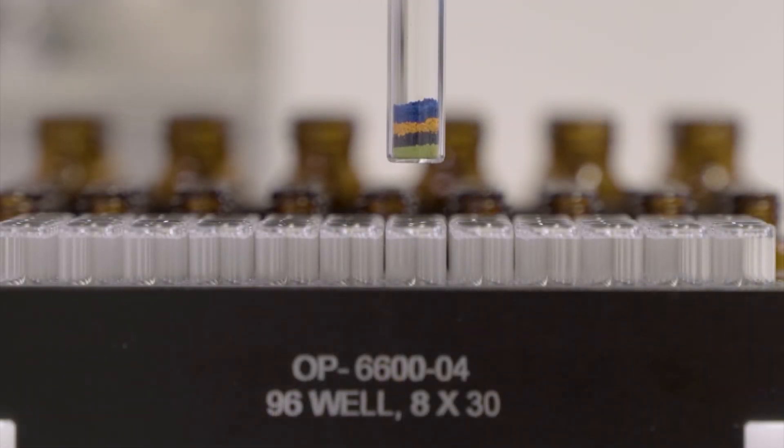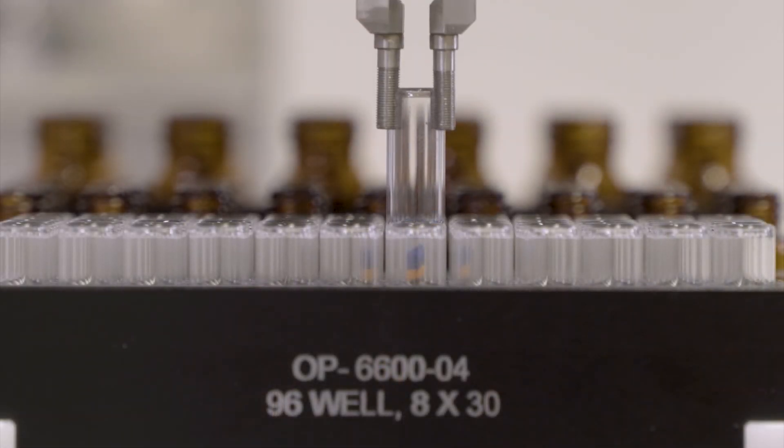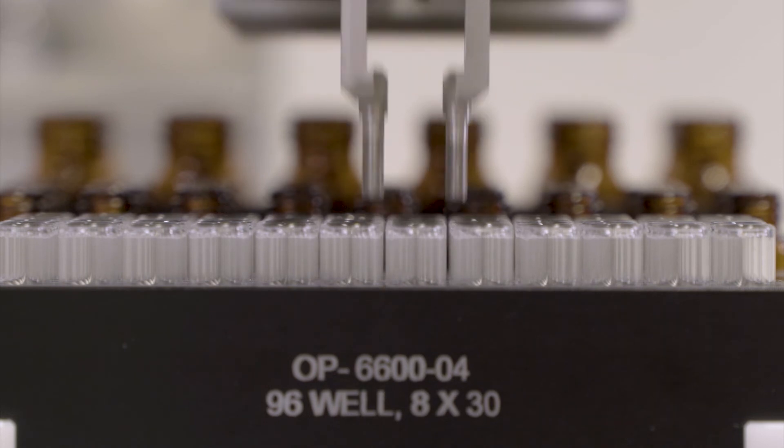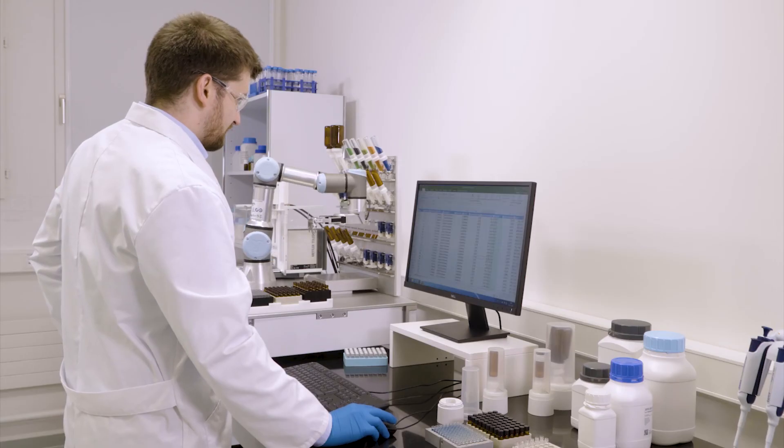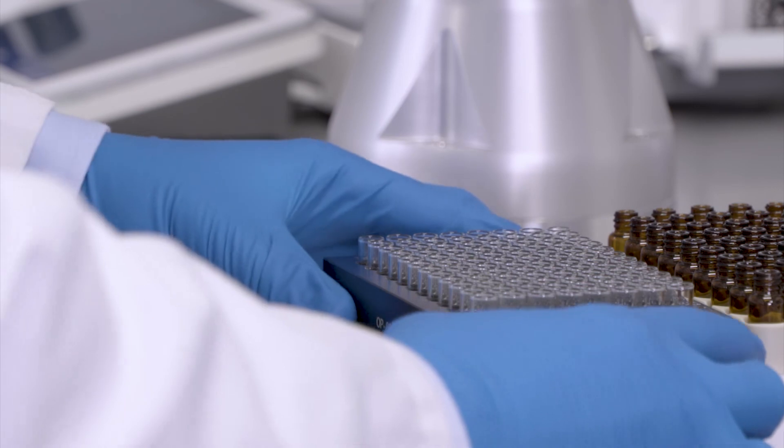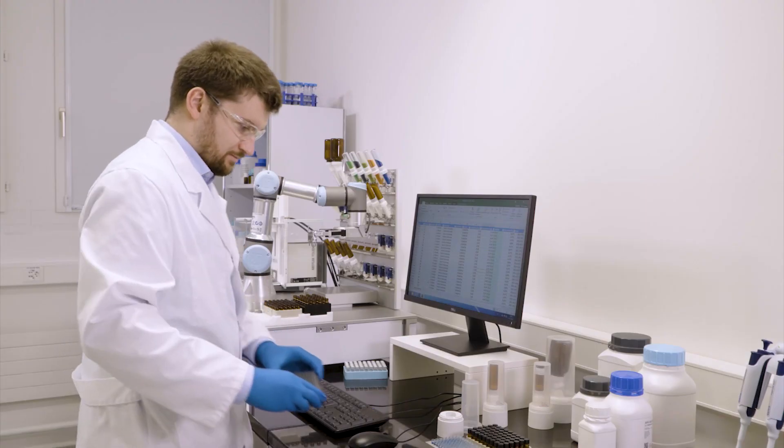Complex multi-component formulations can be prepared overnight or while scientists attend to other work. The reaction samples are then ready for further processing.